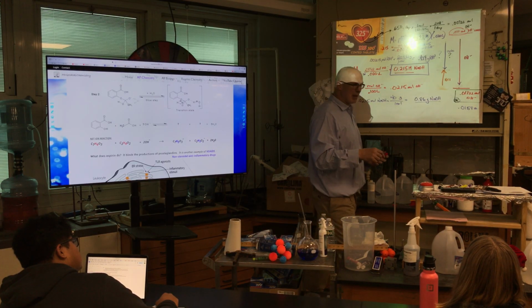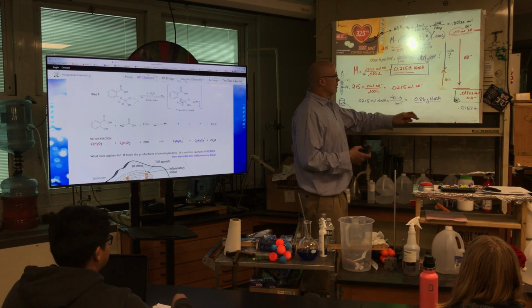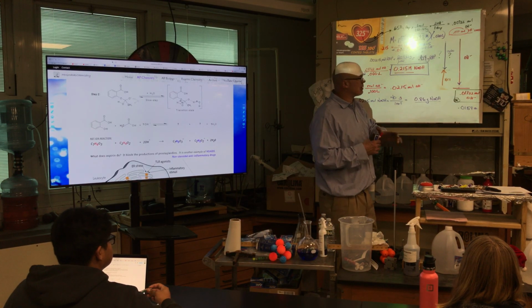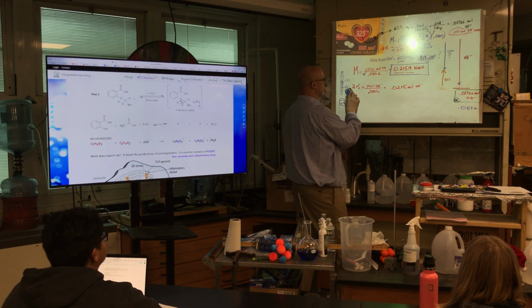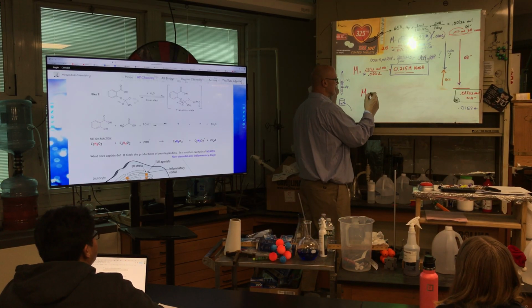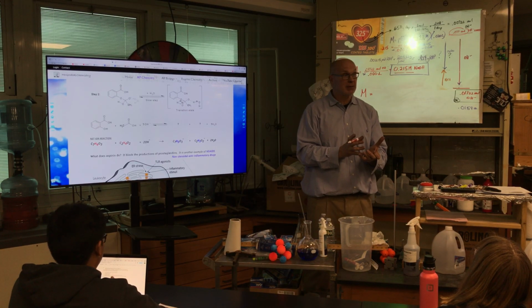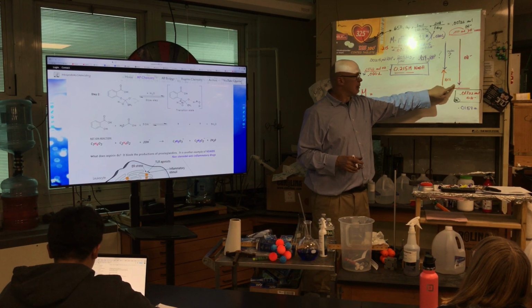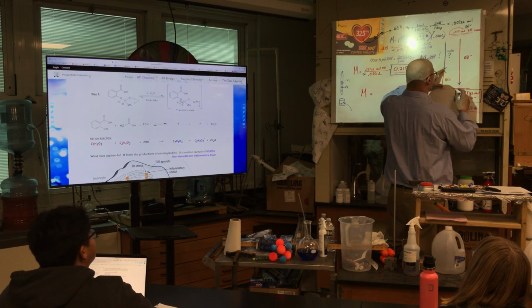So let's go design the molarity of the acid, and we'll finish up here. Remember, I know the target 0.01 is not true anymore. But because we're gonna find it, it doesn't matter if I'm off, okay? So, what do I do here? Okay, the target is 0.01, I'm gonna make a solution. Oh, we're titrating back, aren't we? So we've got the beaker filled with excess acid, correct? I'm sorry, excess base. And now we're gonna add what? Acid to neutralize the excess. So I can subtract it by my new number to get this hidden value.